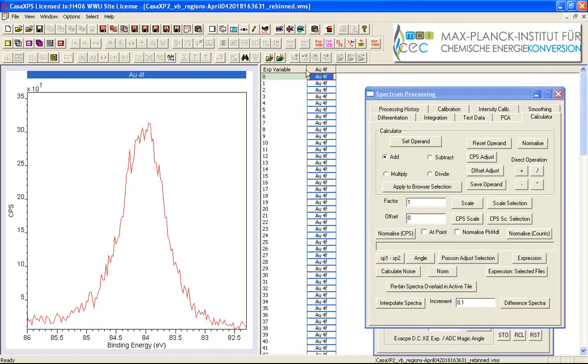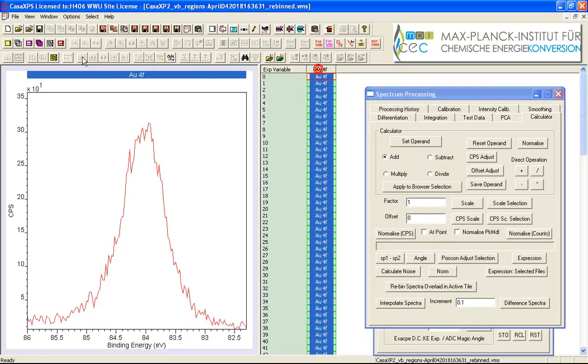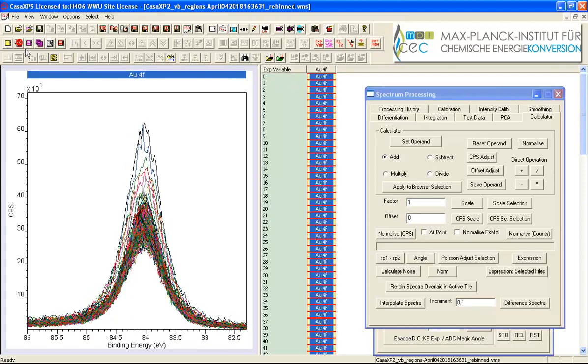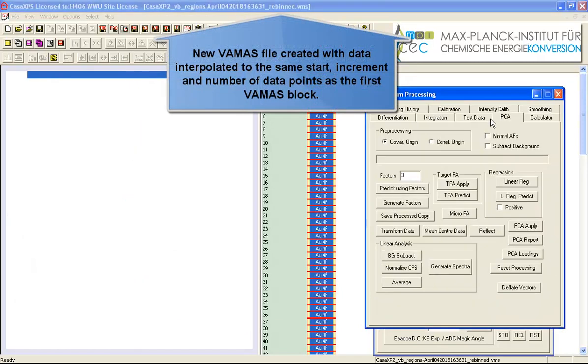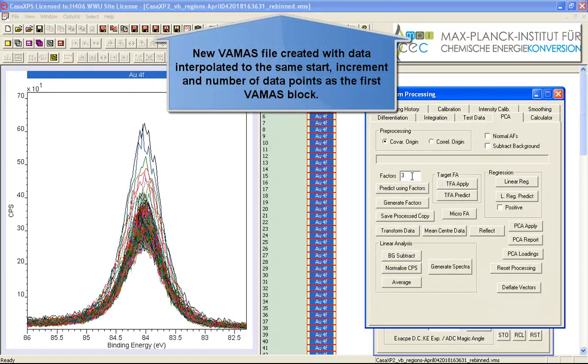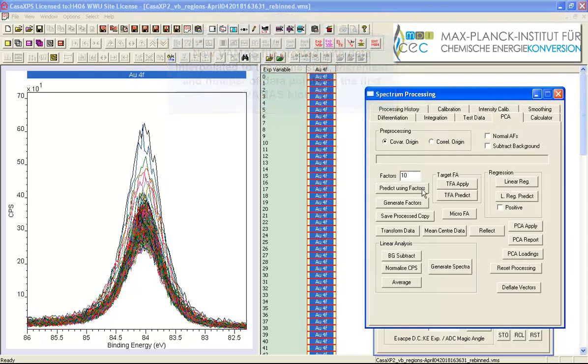So the file looks very similar except now it says rebinned so it reminds me that that's the operation that's been performed and one of the reasons that you might do that is because you want to do some vector type calculations such as principal component analysis.